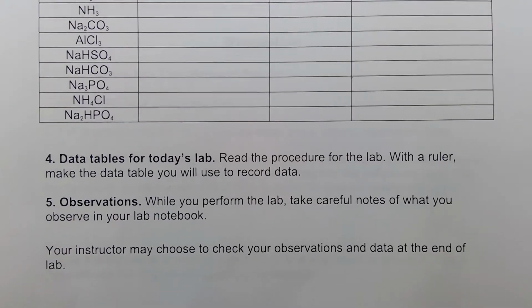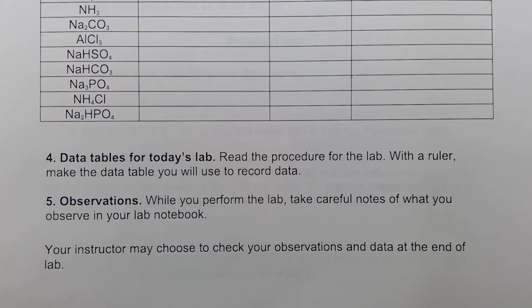And then it also says that you need to make up some data tables so that it'd be easier to record your data while you're doing lab. And then you'll also want to leave some space so that you can write down your observations. So now we should be able to begin.